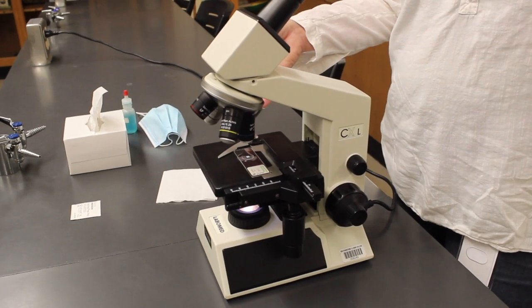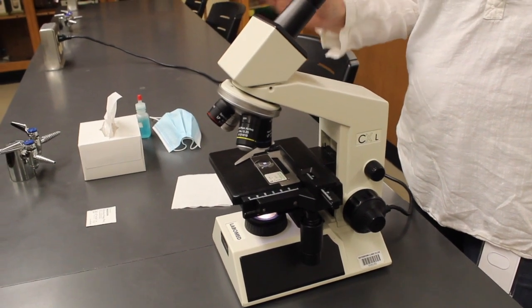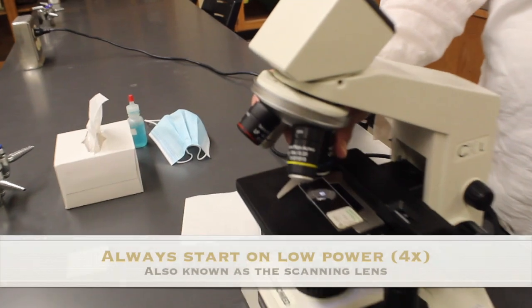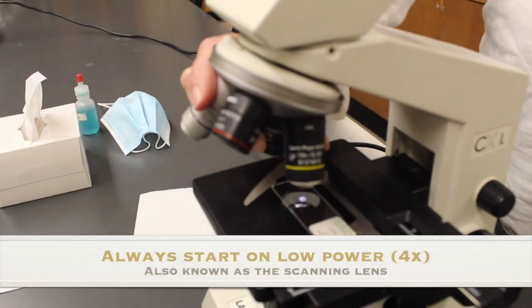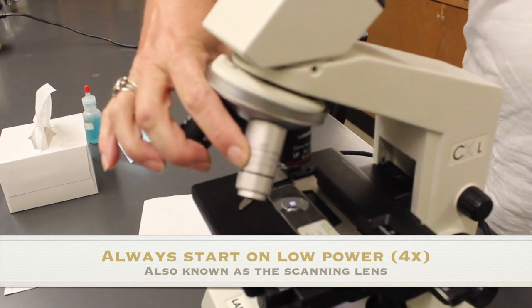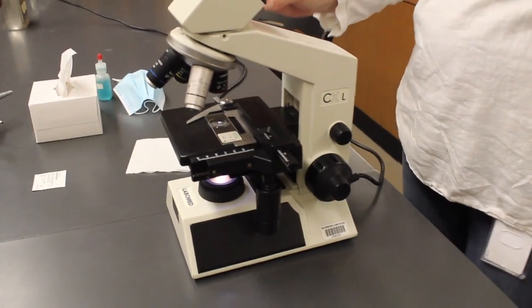The next thing that we're going to do is get the slide in focus. Before we can do anything, we have to make sure we're on low power or 4x. So I'm going to turn my revolving nose piece till it's on low power, 4x. You can hear it clicking into place when I do that.